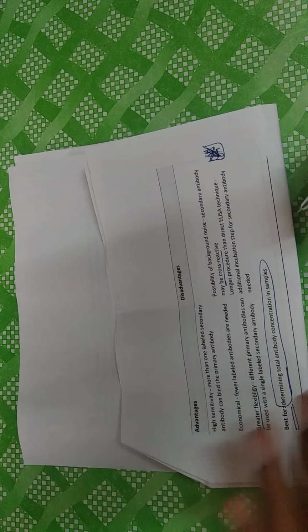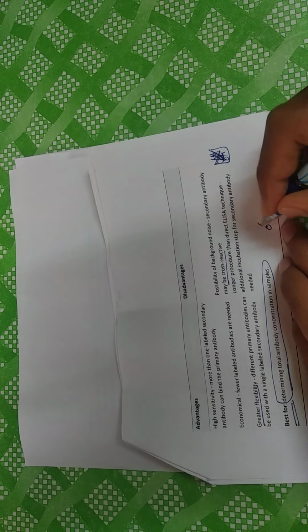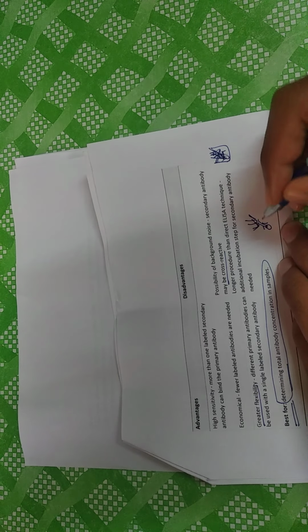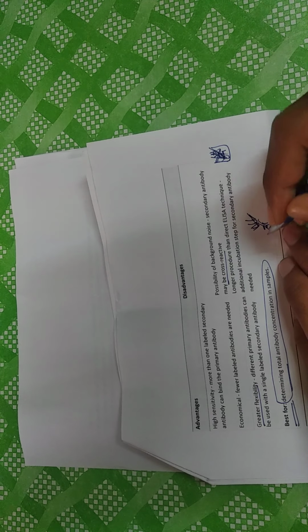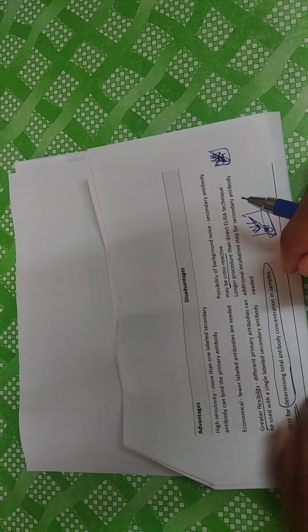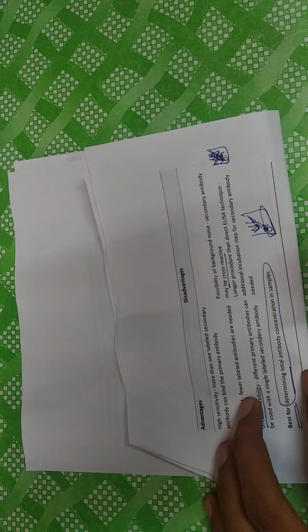In simple sense, it requires two antibodies. The first one is unlabeled, the second one is labeled, and it is mainly used for determining total antibody concentration in the samples.